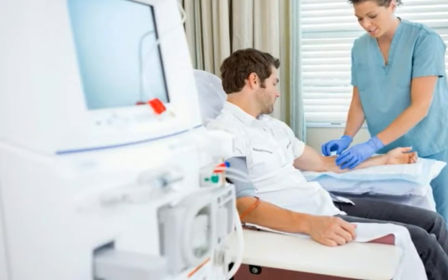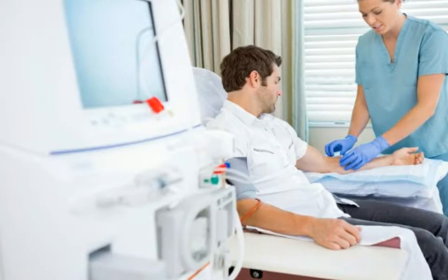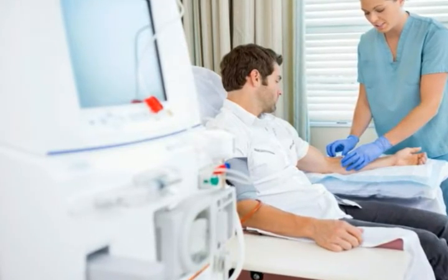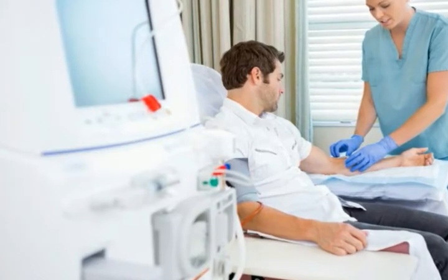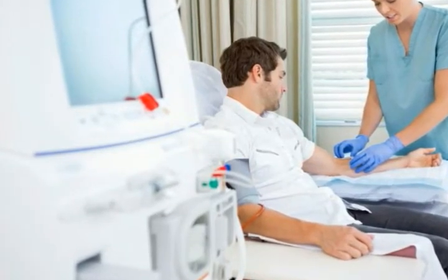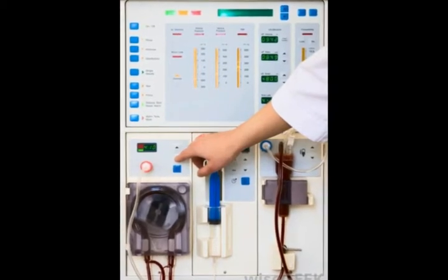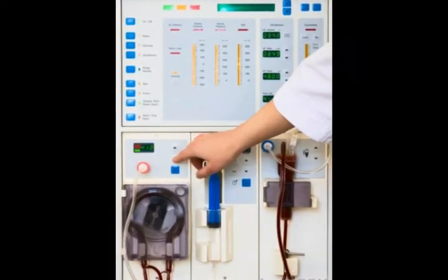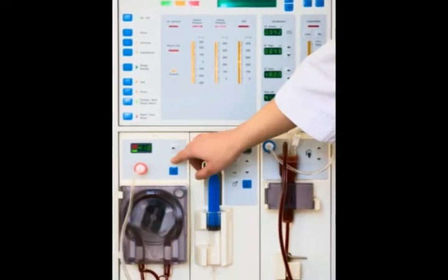The kidneys play an important role in purifying the bloodstream of toxins, and in the absence of treatment, total loss of kidney function is quickly fatal. Dialysis is used to supplement or replace this function in people suffering from kidney injury or disease. The most common method of kidney dialysis, called hemodialysis, makes use of dialysis tubing.